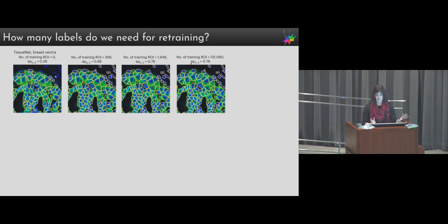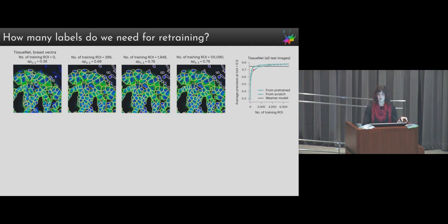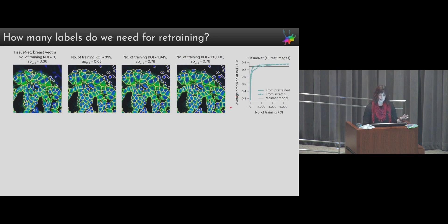We can summarize this across all images in a plot of AP score versus the number of training ROIs used to retrain the model. Starting from the pre-trained CellPose model and retraining, this curve goes up very quickly and saturates around 2,000 ROIs. Starting from scratch it goes up not quite as quickly but still saturates pretty fast. Comparing to the model provided with the paper — trained on all images and all classes — already with very few training ROIs we can outperform that model. So the good news is you may not need to label that much.